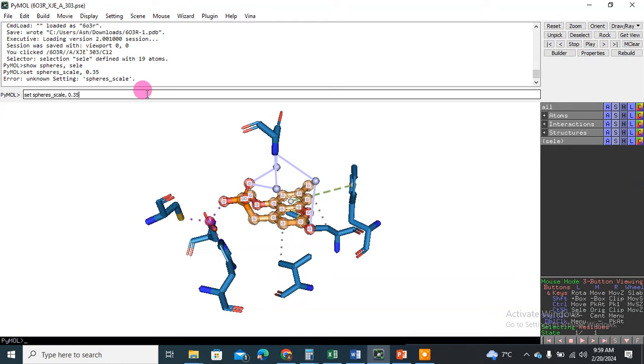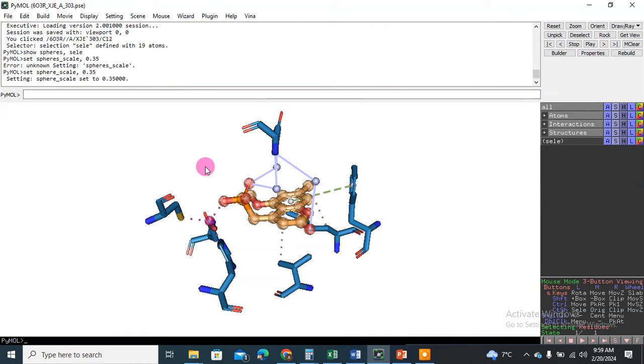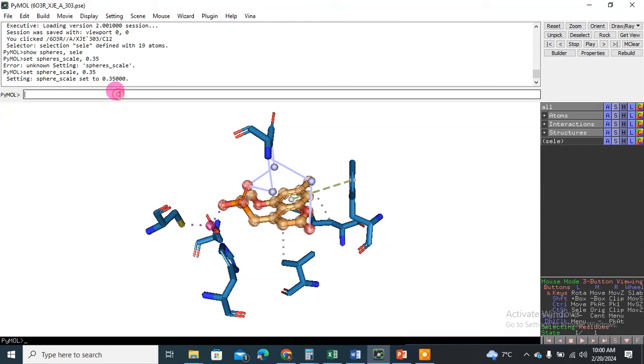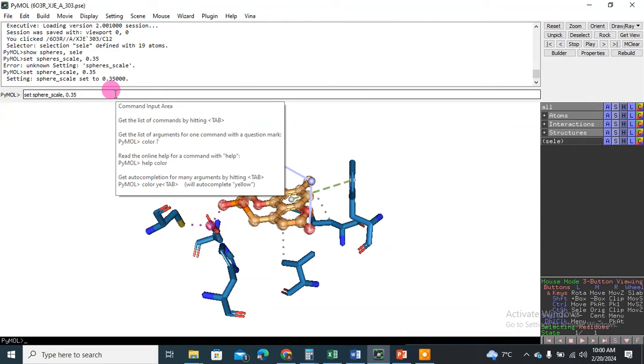Oh wait, okay, it is already 0.35. Let's make it bigger.